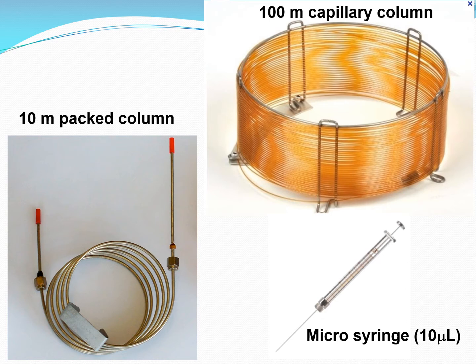This is a syringe. It is a micro syringe of capacity 10 microliters that is used for injecting the sample. The sample is taken in the liquid state, it is injected, and it is vaporized.